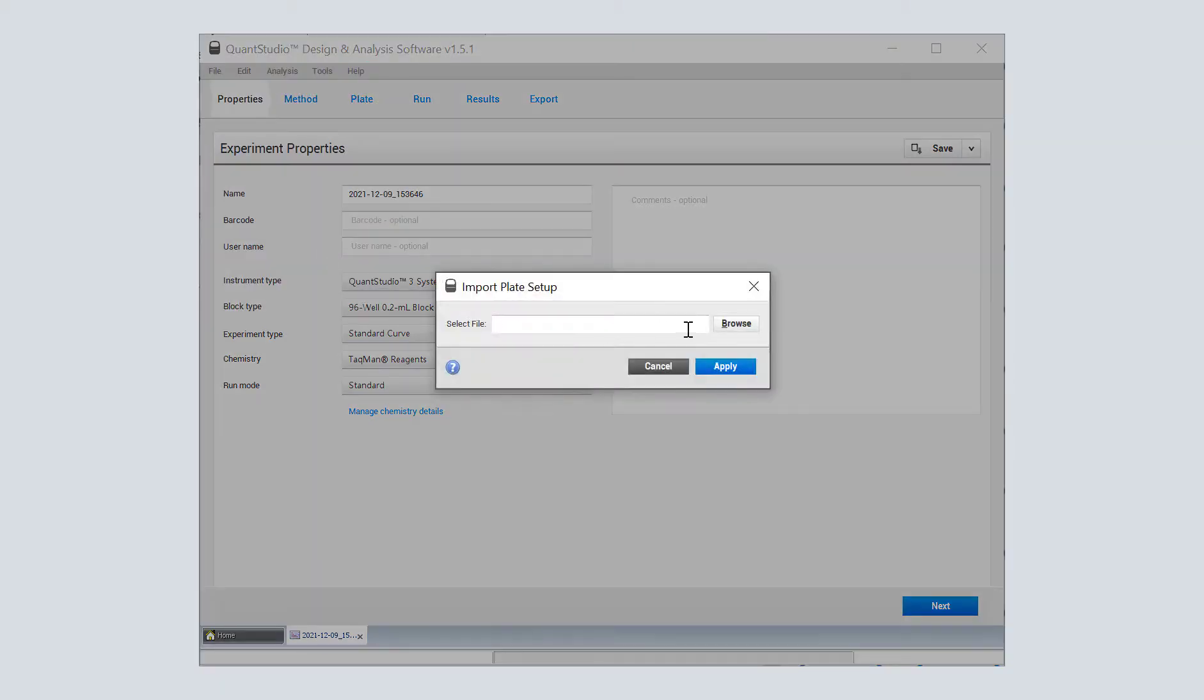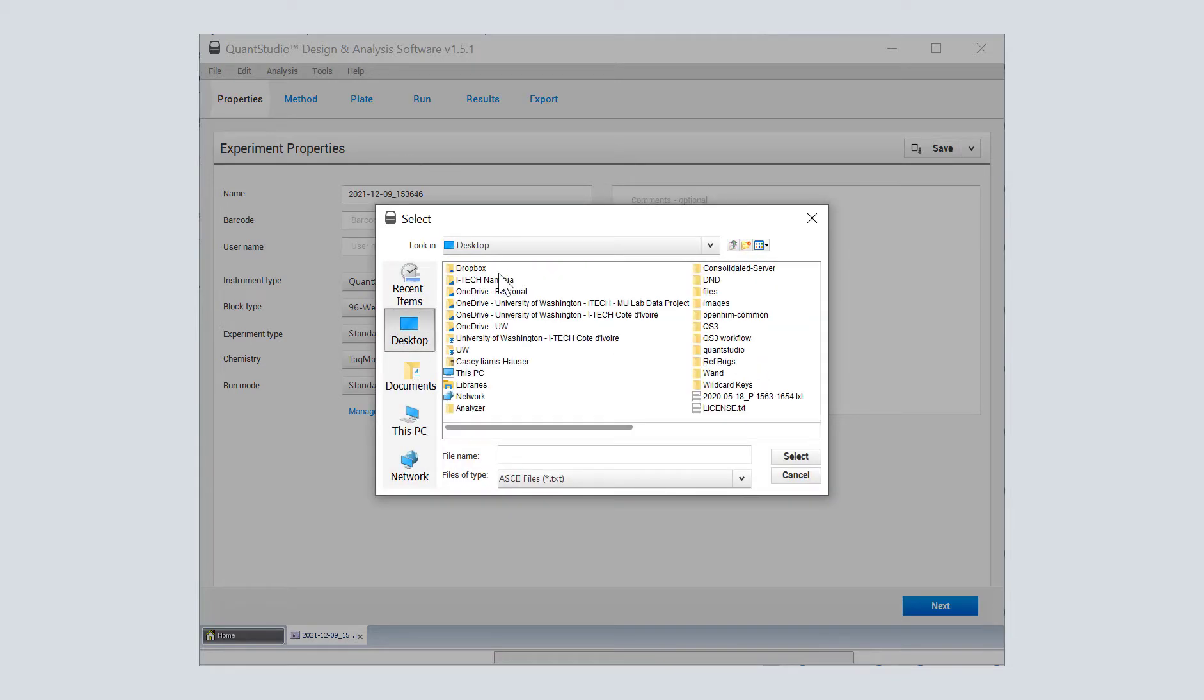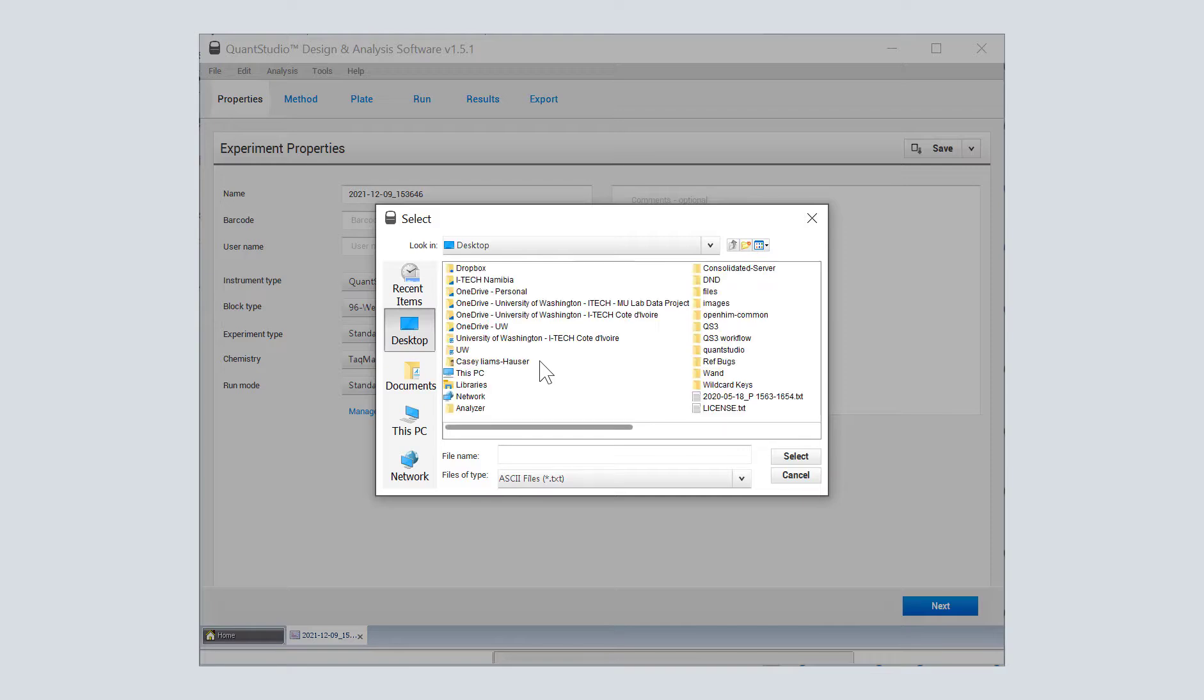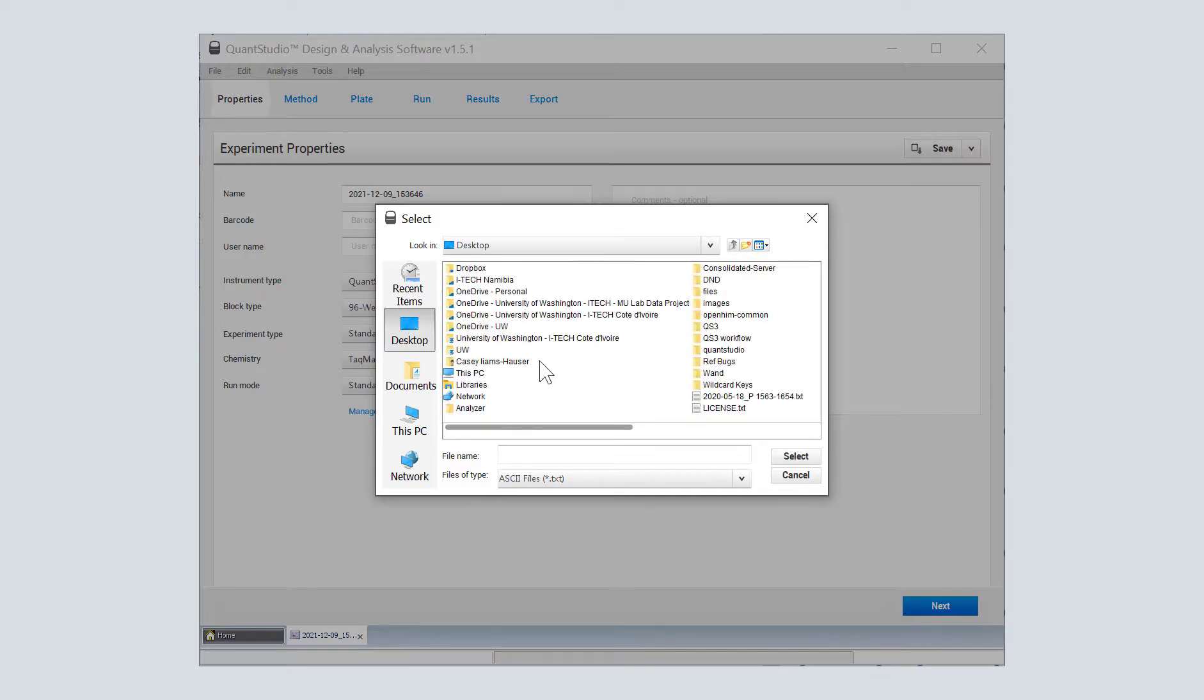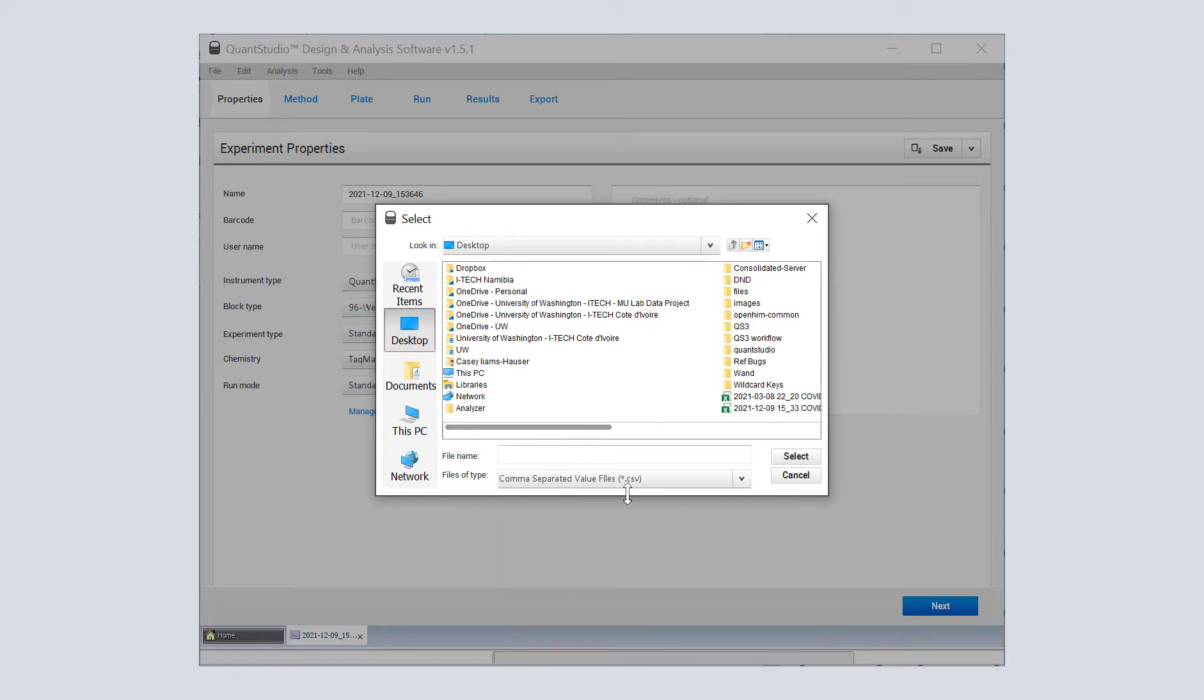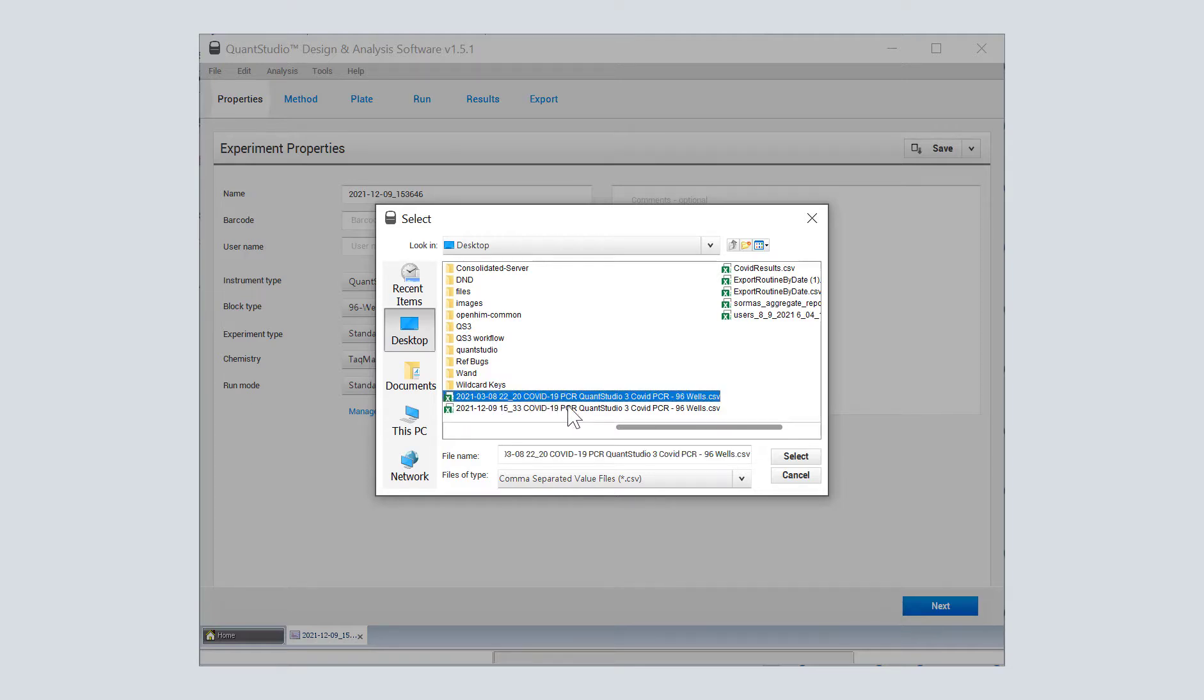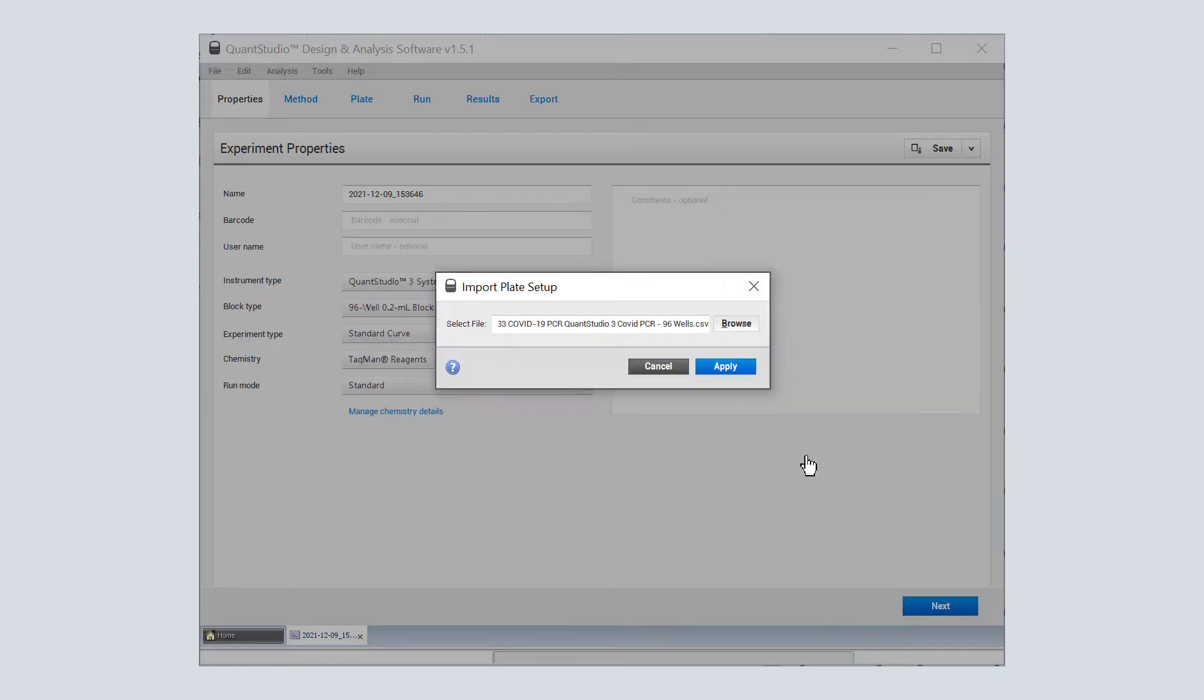We're going to browse for that CSV that we completed on the OpenAlice side. It starts out showing us text files, so I'm just going to switch this file type to CSV. And here we go, the 96-well plate setup that we've got.